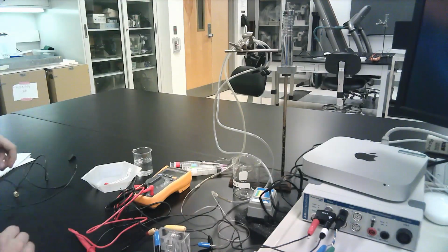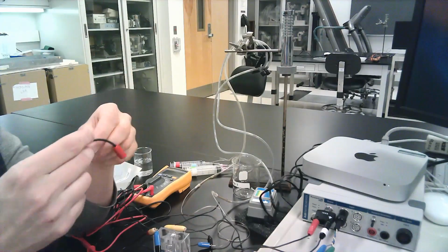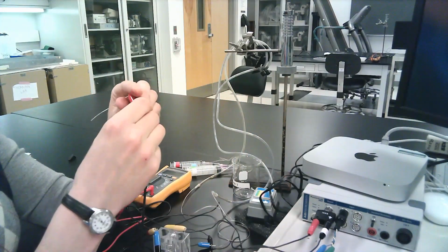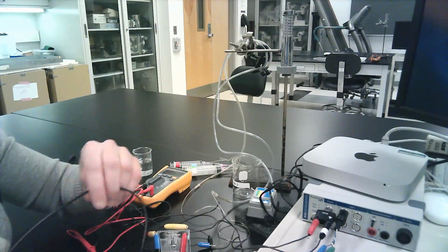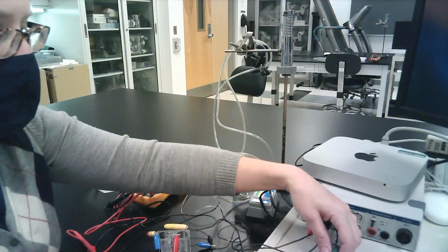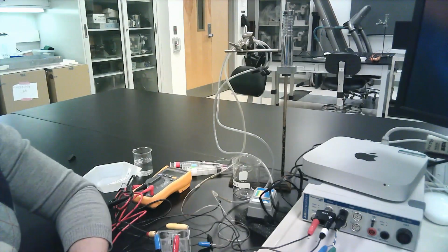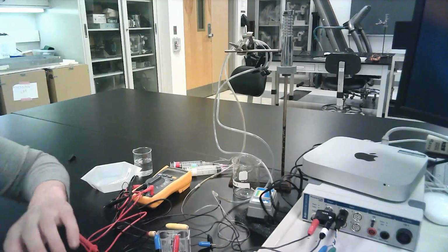And then last but not least, I've also got a red recording electrode. So I'm going to plug together the two parts of that red recording electrode, pop that into the opposite side, and then that's going to connect into the yellow connector on the input for the Power Lab. So that's going to get all of my wiring hooked up together.